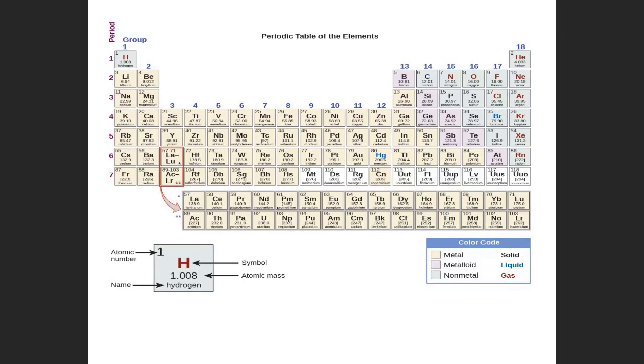And then the color. The color you are going to observe, there are so many. Basically, they are mostly shiny and mostly gray. So write whatever is closest to what you are observing. You can also help yourself by finding out more information about that metal. And then there is another column that you have to complete for nickel, and it's asking you if it's a metal or a non-metal or a metalloid.